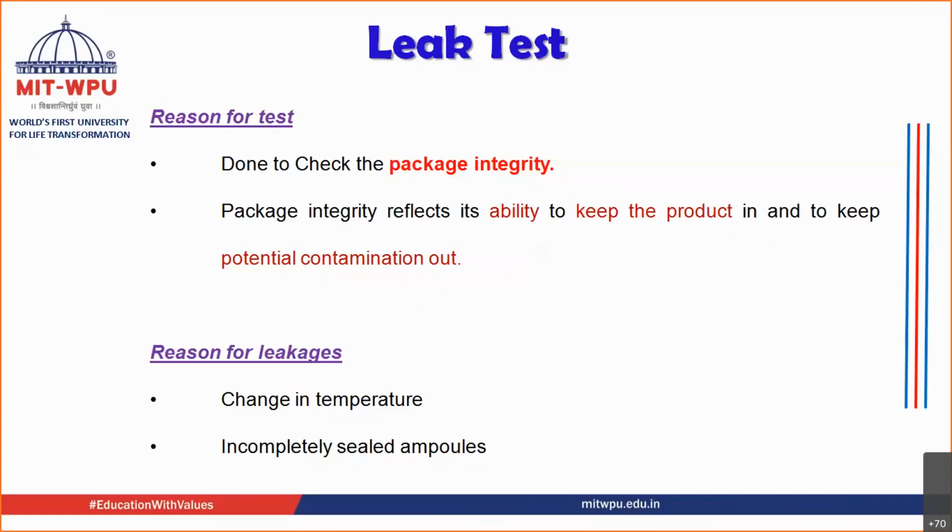Packaging integrity is the ability to keep the product safe and to keep it out of potential contamination. It may be particles, it may be microorganisms. You want it to be safe from that contamination, right? That's why you carry out this leak test.